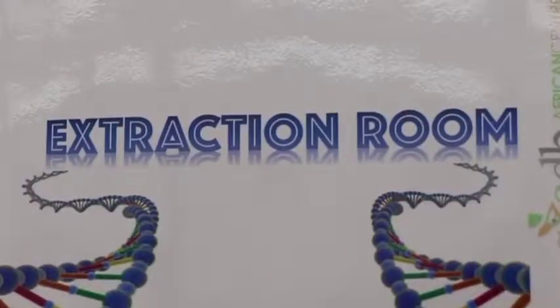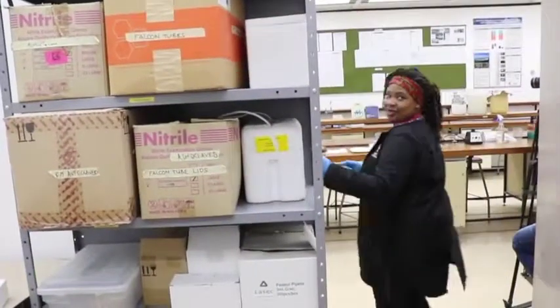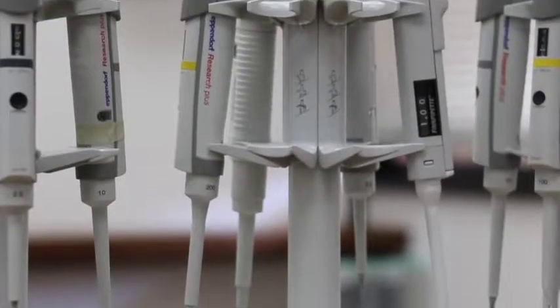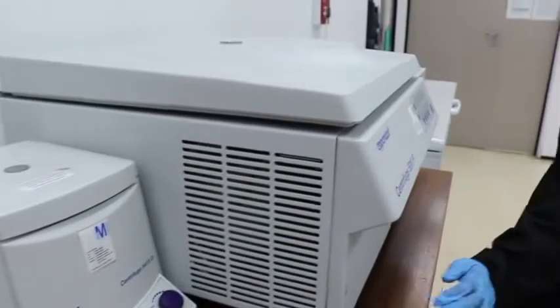There are three basic steps to DNA barcoding and we have four rooms in here which we use for DNA barcoding. This right here is the extraction room — that's where we get our samples and extract the DNA from them. Then we go into our main lab where we do most of our physical work with the extracted sample. This is the main lab where most of our lab conductors and instructors come to do their physical lab work.